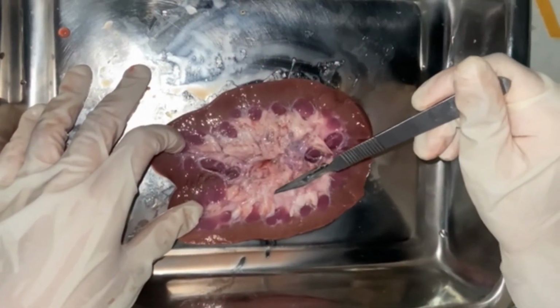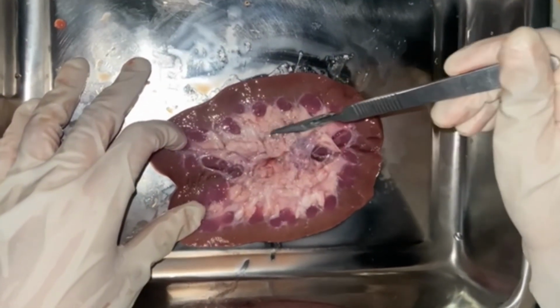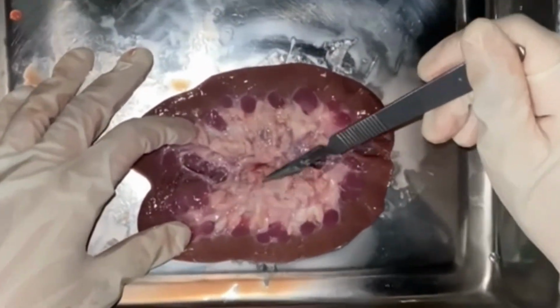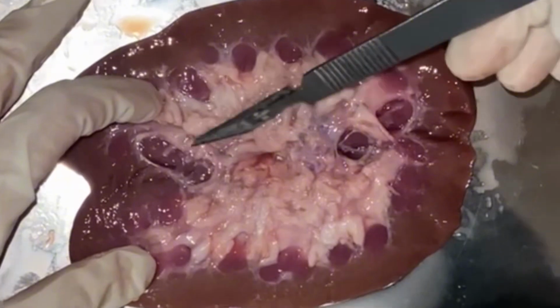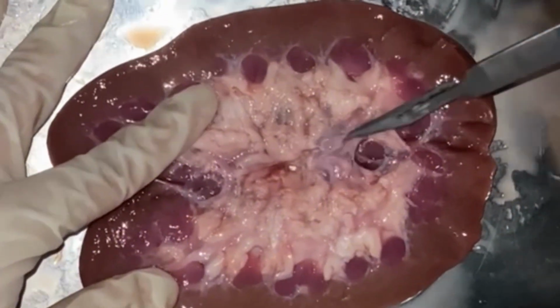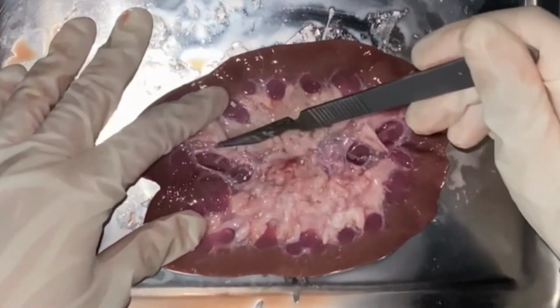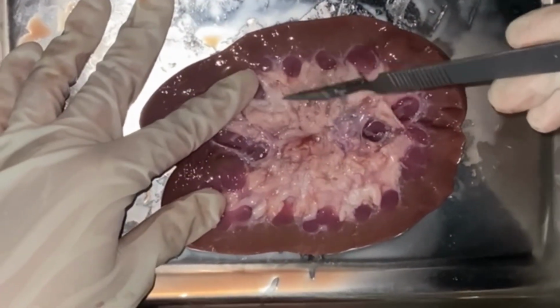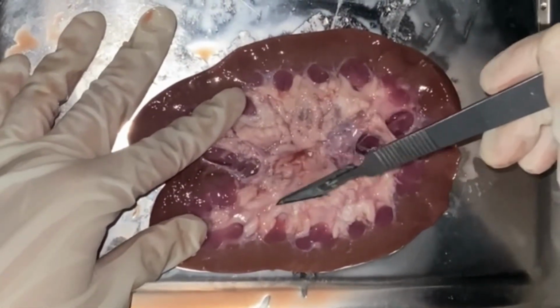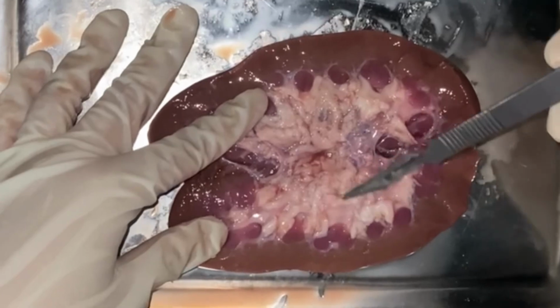Feeding into the center is the renal pelvis. Extensions of the pelvis are the calyxes, which enclose the tip of the renal pyramids. They collect urine, which continuously drains from the tips of the pyramids into the renal pelvis, which then drains into the ureter, which transports the excretory products out of the kidney towards the urinary bladder.